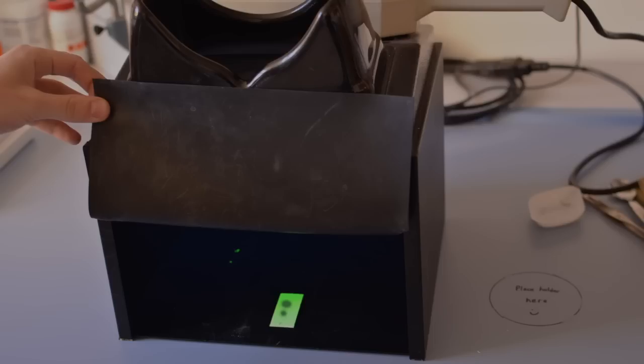The silica on the TLC plate is impregnated with a fluorescence dye for contrast. Using lamps with variable wavelengths will give you access to identification of a wider variety of unsaturated compounds.